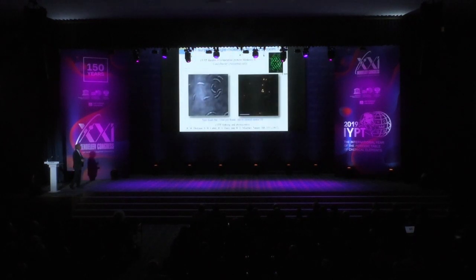So now that people started studying single molecules at room temperature in the mid-1990s, surprises started to appear. Again, just like at low temperatures. So what surprises? On the left are bacterial cells in white light. So I'm just showing you in white light a few bacterial cells. They're pretty small. But on the right, I'm showing you the light coming from that sample. And in these bacteria, a particular protein has been fused to yellow fluorescent protein. So this fluorescent protein is a label, and you're looking at the light from the label, right?